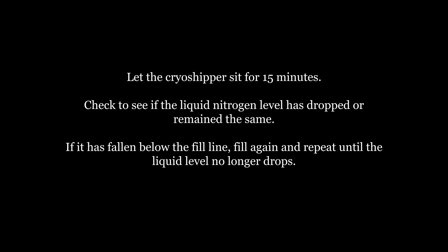Check to see if the liquid nitrogen level has dropped or remained the same. If it has fallen below the cryoshipper fill line, fill again and repeat until the liquid level no longer drops.